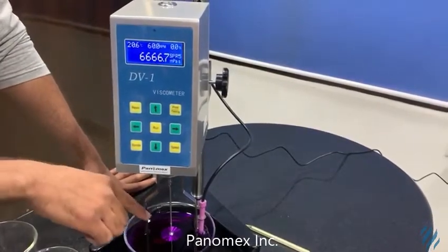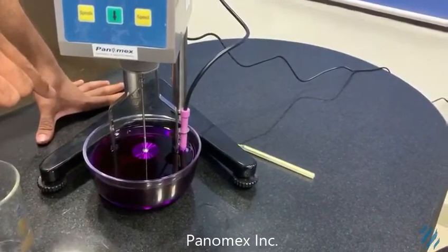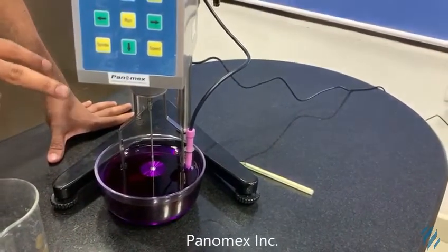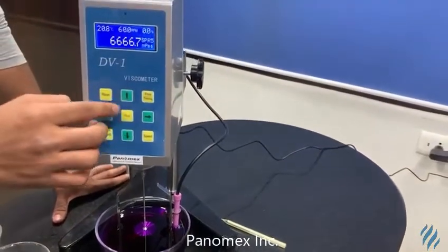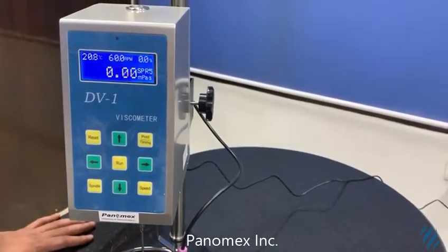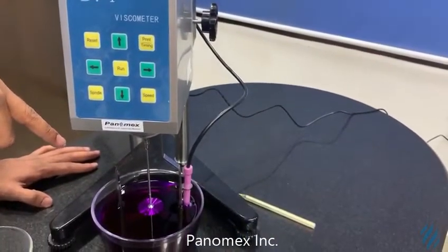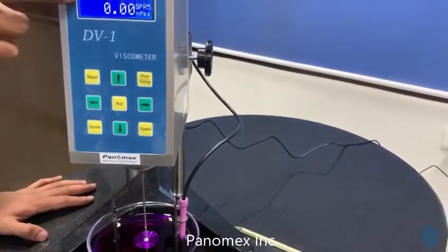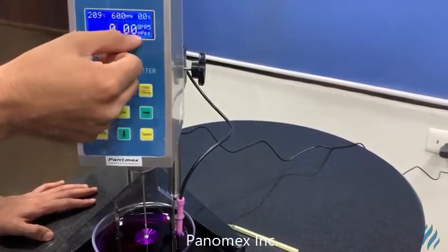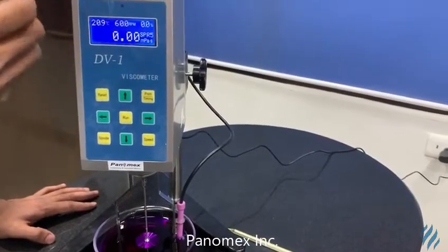First, what you need to do is make sure that this portion is dipped inside the water or the solution which you are having. After doing this, you press the run key. As I have pressed the run key, you can see it is moving. It is also showing the temperature, the RPM maximum, and the current viscosity.